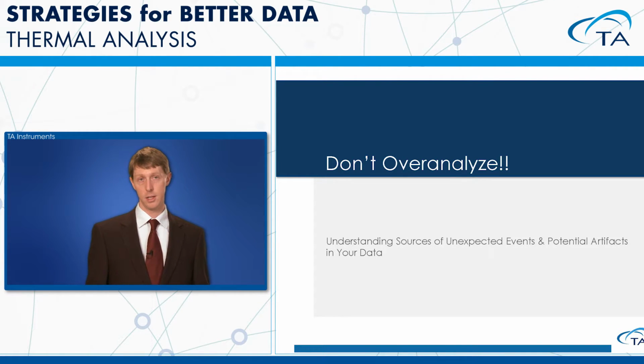So, the next section here is really going away from the structural correlation. We could probably spend all day talking about how structure and the various tools interact, but the next section is: don't overanalyze. And this is a fairly common pitfall that we all find ourselves in, is that we think that there should be something in a particular data set, and we start to look into it and we say, oh, well, this has to be this transition, and this has to be that transition, or there's something wrong with my instrument because it's giving me this particular effect. And so in most cases, the most obvious answer is the answer. It's hard for us to sometimes believe that that's the case.